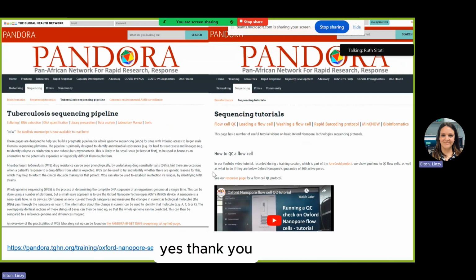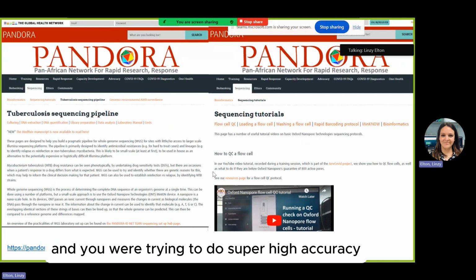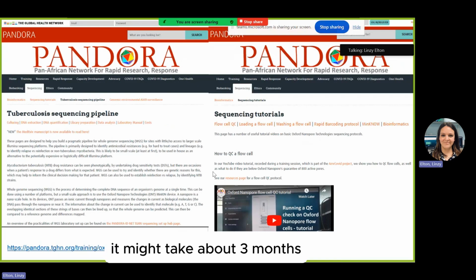Yes, thank you. If you had a slow computer and you were trying to do super high accuracy, it might take about 3 months because the base calling is so slow.